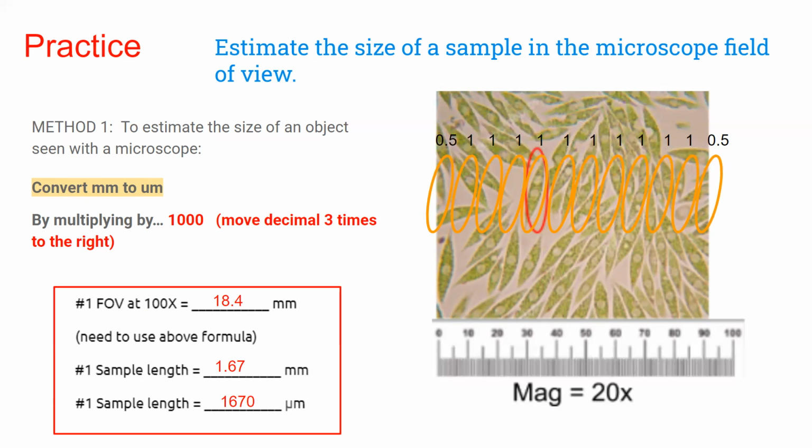Well, if you wanted the actual size of the organism, yeah, because I was just showing that so you can see this is what I'm doing. But you should be doing. I say that's 2.5.